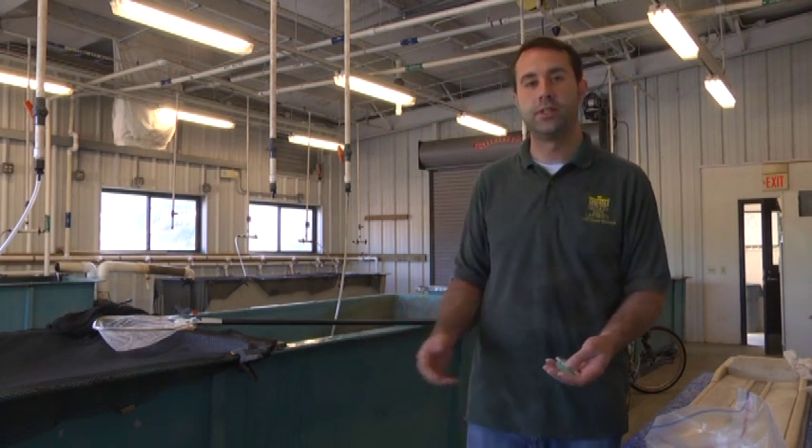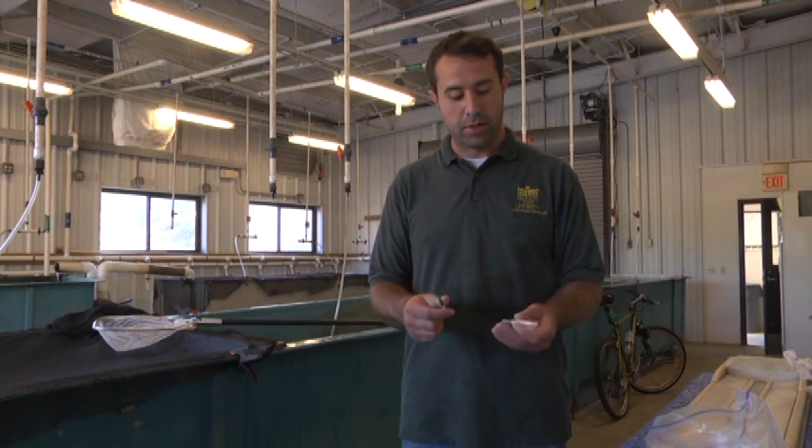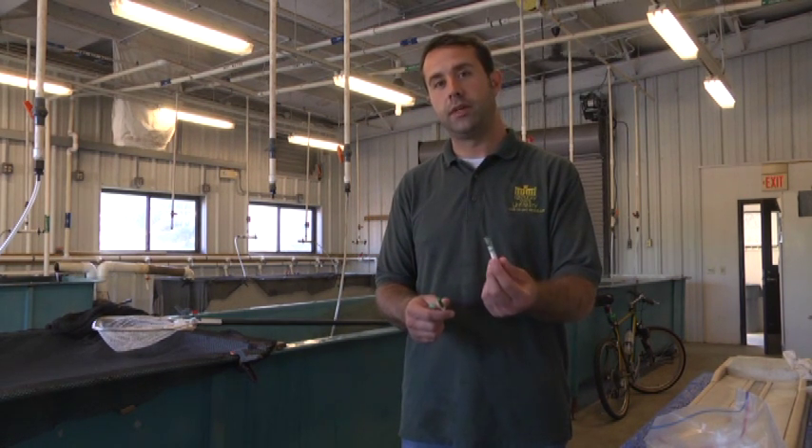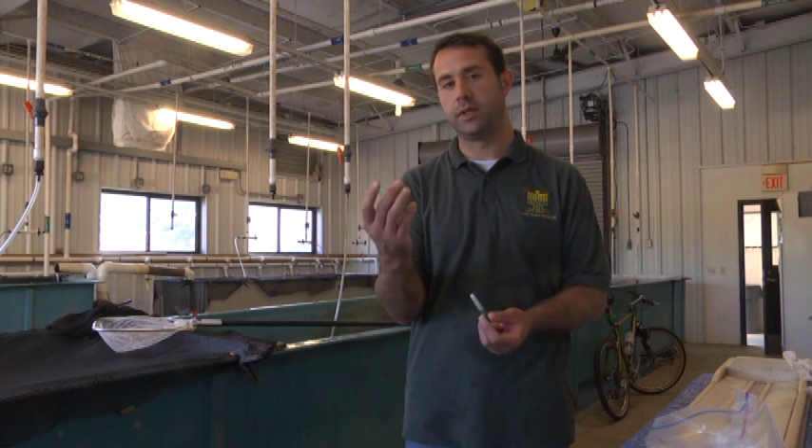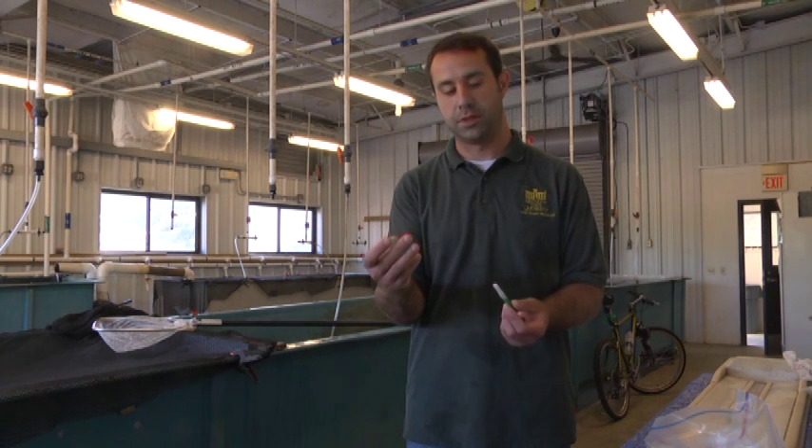After that, we're going to take a fish out, get a weight and length from the fish, and then draw blood. What we need to draw blood are vacutainers. These vacutainers contain lithium heparin, a needle, and then this little needle holder. Basically, this holds the needle in the vacutainer. These are the three things.